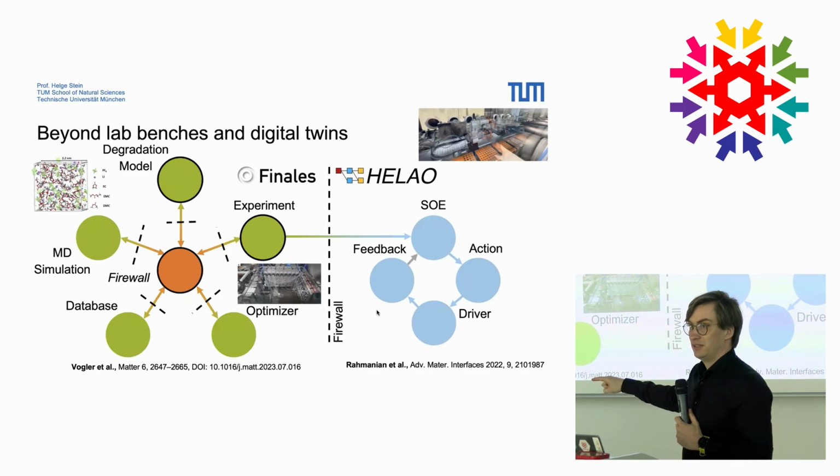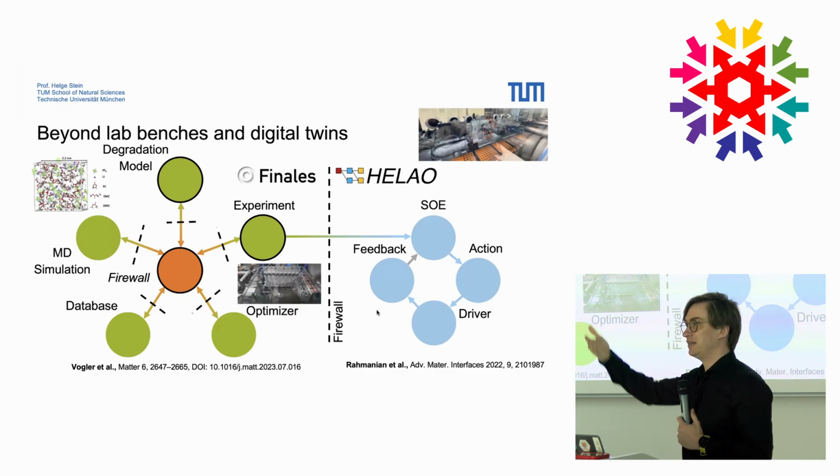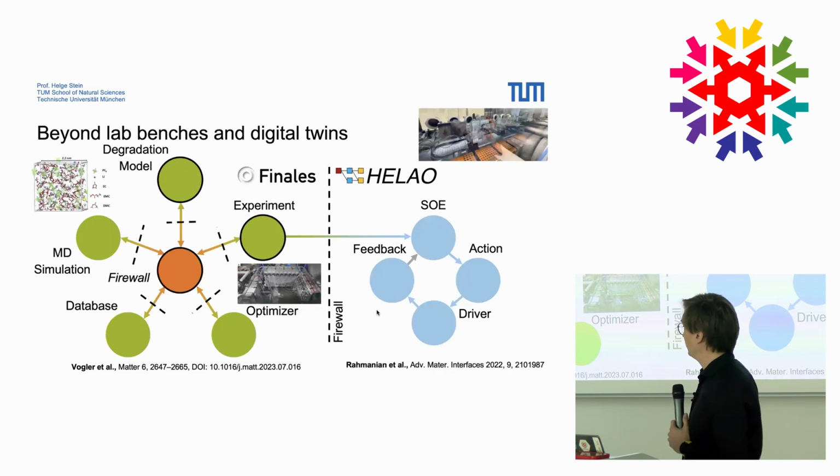Cool thing here is, this is completely agnostic to what kind of workflow manager you use, what kind of lab automation you use. Even if you don't have any lab automation and you do everything by hand, in the end, it's a schema. I mean, come on, you can fax this if you want. So it's relatively fast. On my laptop, I can handle about 4,000 requests per second.